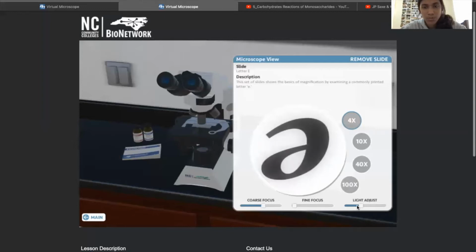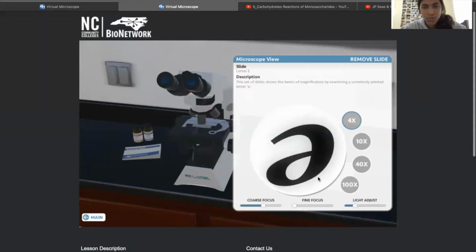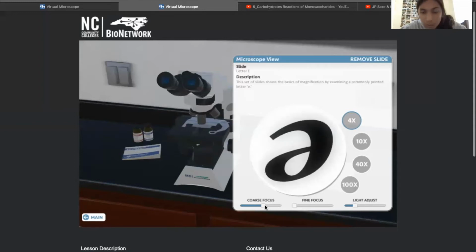When you start in your real microscope, the light power should be off, so start by turning it on and increasing the light. In this simulation, not much had to be adjusted since it was already on. Next, you want to use the coarse focus to get the best view of the specimen viewed. Make sure to always have your specimen properly positioned in the center, otherwise you might lose it as you progress. You may adjust the light, but for the lowest power lens, stick to the coarse adjustment and you can progressively adjust the fine as you go along.